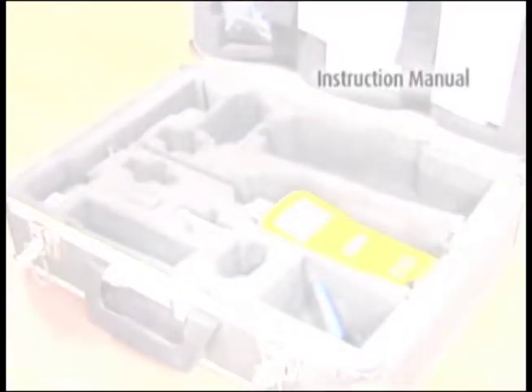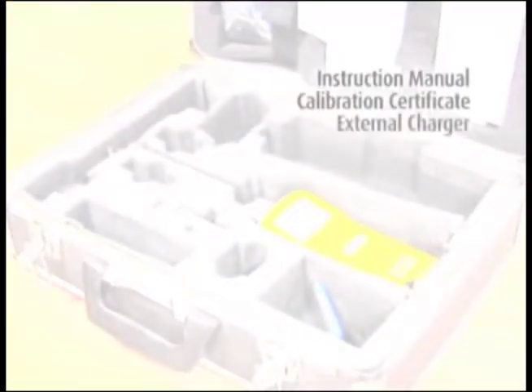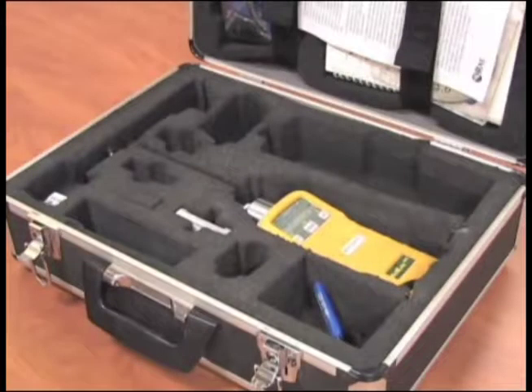The Mini-Ray 2000 comes with an instruction manual, a calibration certificate, external charger, CD software, data transfer cable, zero filter, and technical note TN-106. Unpack and confirm you received everything.